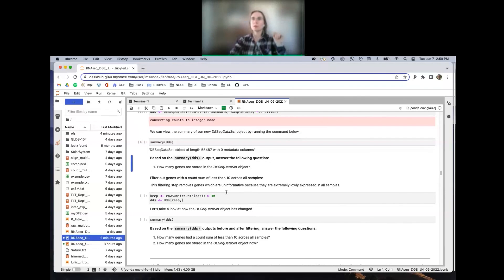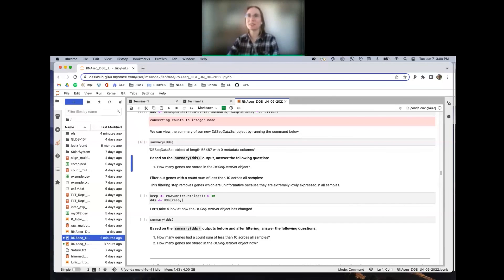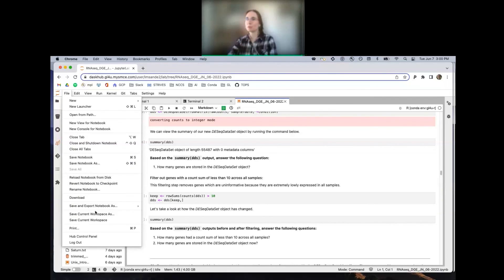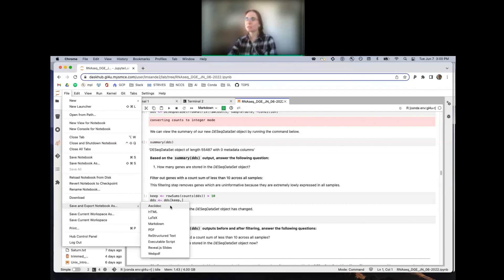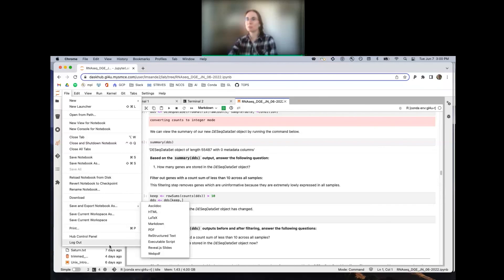At the end of the last notebook, we noted there were genes with zero expression across all samples. Now we're at the end of the day. You are able to save your notebook by going to File > Save and Export Notebook As HTML, then save it locally. Everyone please remember to log out or stop your server by going to File > Log Out or Hub Control Panel.